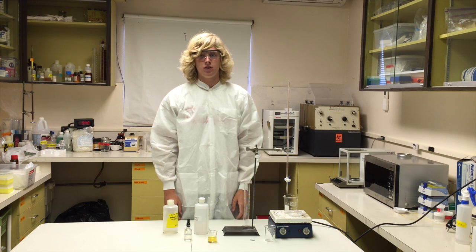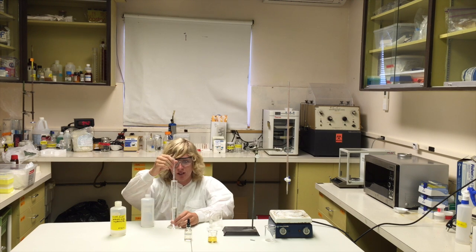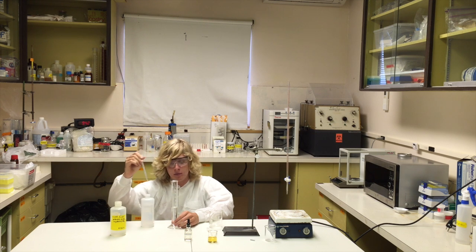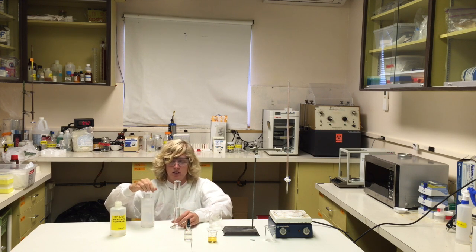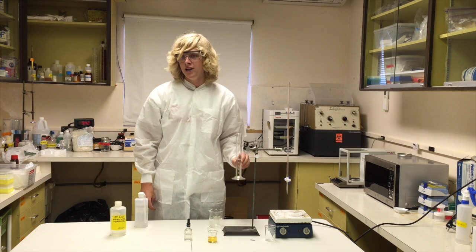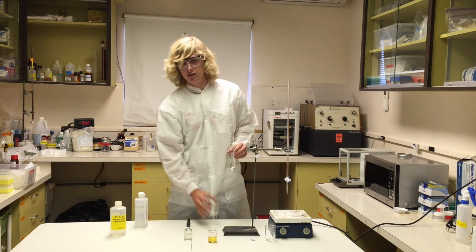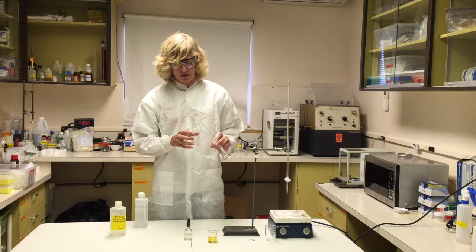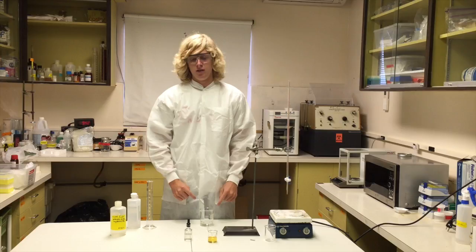The first step is going to be the blank titration procedure. We're adding 50 milliliters of isopropyl alcohol to the 250 milliliter beaker, and we're using a graduated cylinder to measure it. Here we have our 50 milliliters of isopropyl alcohol, and we're now going to add this to the 250 milliliter beaker. Then we're going to add 8 drops of phenolphthalein indicator.